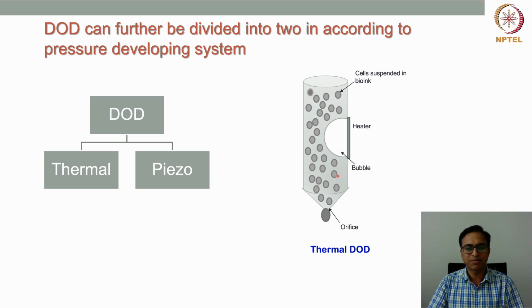Now consider this single nozzle. In case of thermal, a heater is attached to each of these nozzles, right? The nozzle is filled with the liquid containing cells, biomolecules, or biomaterials.